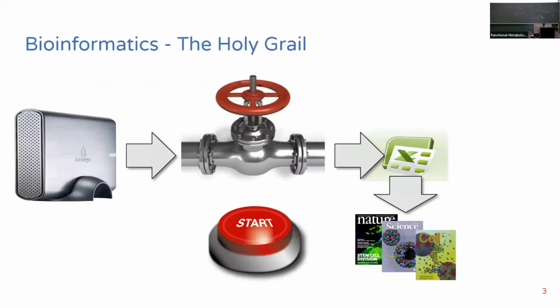I really like this figure because it is the thing that we have in mind when we talk about pipelines. Most often we have some button that we press and we don't really know what's happening. It's a kind of black box. And of course that's bad, but some experimentalists would like to give the data on their hard drive and get the final Excel sheets out of it with all the nice figures and statistical data for their publications.